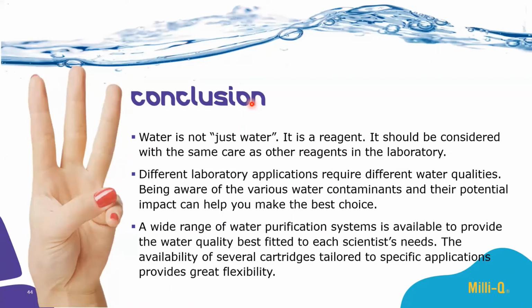And to conclude, just like I mentioned, water is really the most widely used reagent in the laboratory. So water is not just water, it's a reagent. It should be considered with the same care as other reagents in the laboratory. For example, if you are running an HPLC in your laboratory, the water you use to run the mobile phase or to prepare samples for HPLC should be considered with the same care as the HPLC-grade methanol or acetonitrile that you buy. So the same consideration should be given to the water.